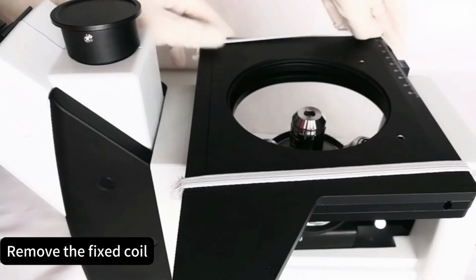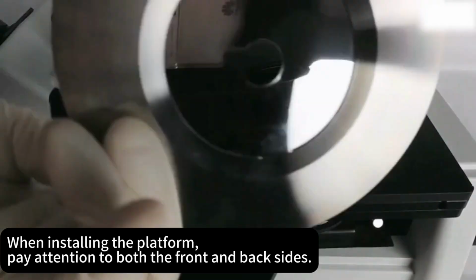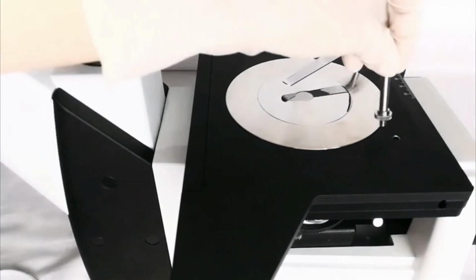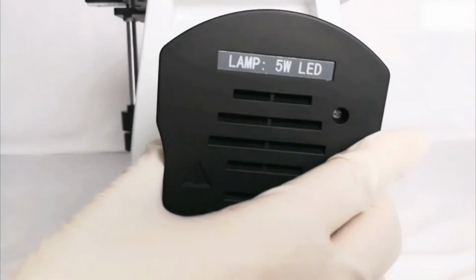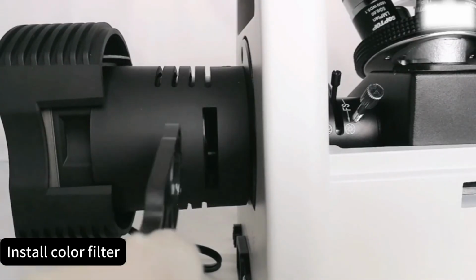Remove the fixed coil. When installing the platform, pay attention to both the front and back sides. Install tablet clamp. Align the lightbox pins with the main unit's connector and install the lightbox. Install color filter.